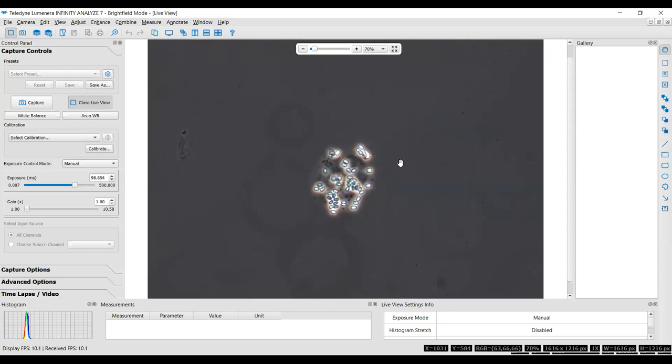So Anne, on counting, would you count that colony we see as one natural unit and then count the individual cells? Yes. Yeah, cool. I count the cells, I count up to 50. I have to admit, I estimate above 50, but I count up to 50 manually. And then the others, so the hard part is, and this will be a conundrum, right? So you want to count natural units, but you don't have true natural units in the sample. And you also have a limited lifetime.